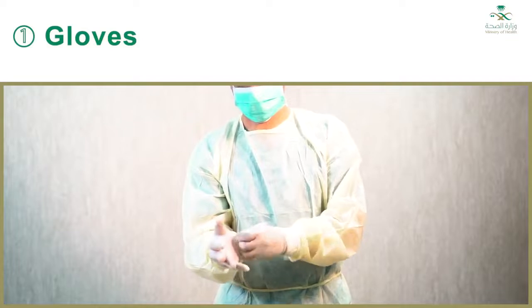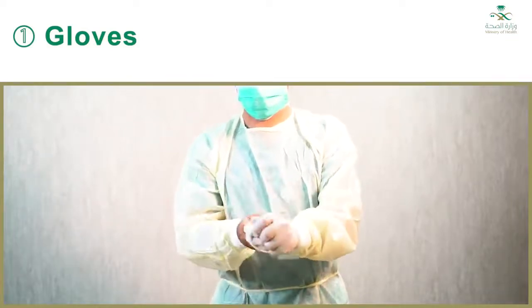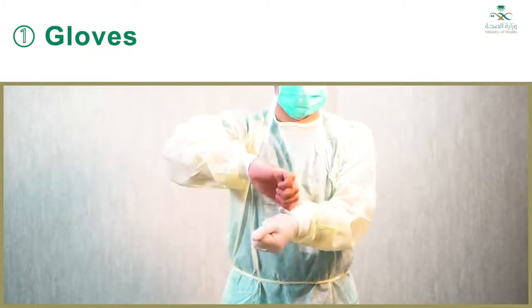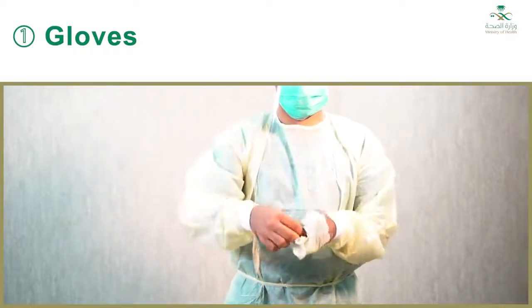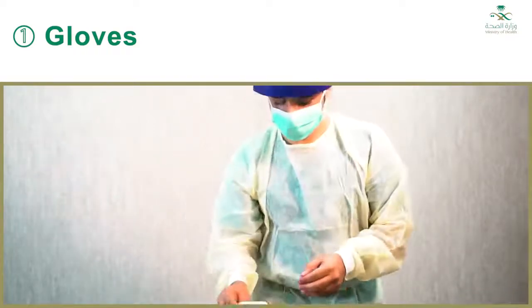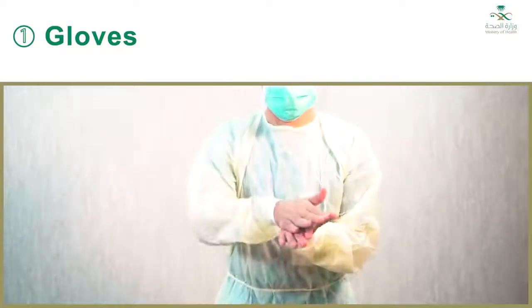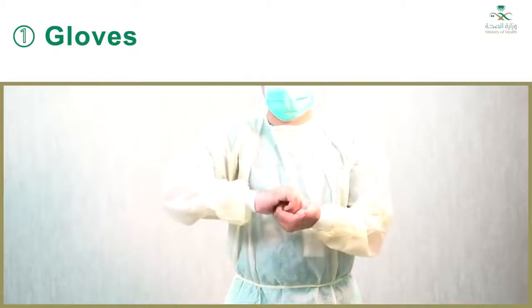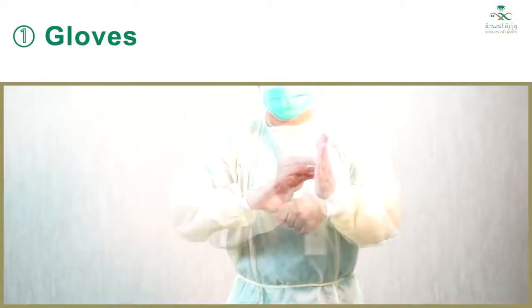Now, removing PPE. 1. Gloves. Outside of gloves are contaminated. Using a gloved hand, grasp the palm area of the other gloved hand and peel off first glove. Hold removed glove in gloved hand. Slide fingers of ungloved hand under the remaining glove at wrist and peel off second glove over first glove. Discard the gloves in a waste container.